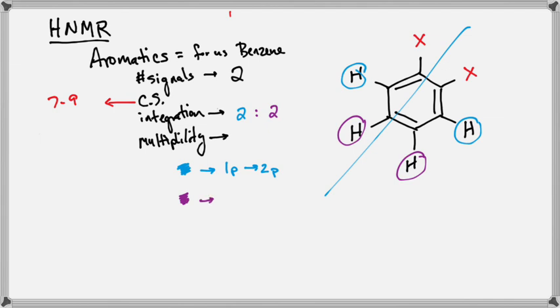Who said 2? Okay. Does it see 2 neighbors? I'll absolutely give you the 1, but now the question is, does it see the 2? They're chemically the same. They're effectively in the same house. What you're now saying is that in the CH3, those hydrogens are all neighbors. I did it again. Those hydrogens are now all the same thing. Not true. Okay? So it's still one neighbor.